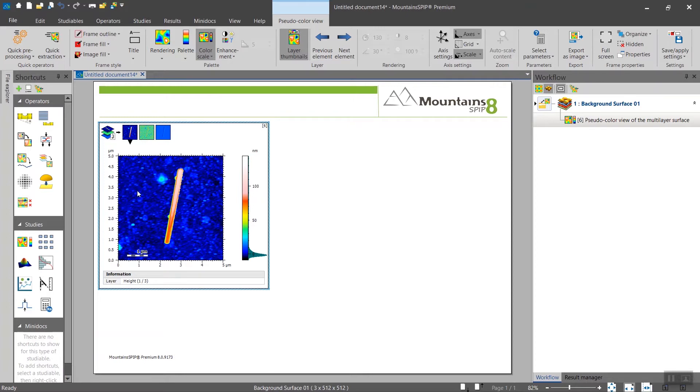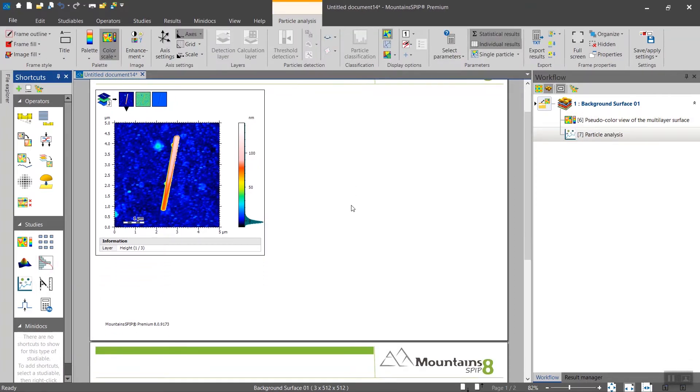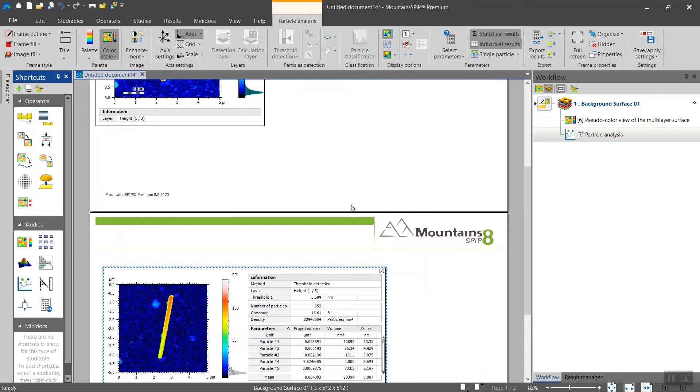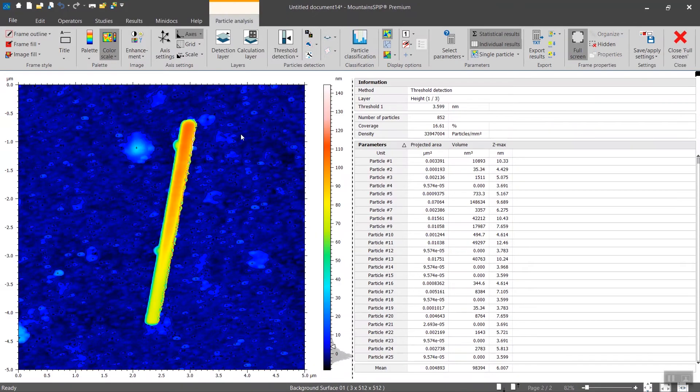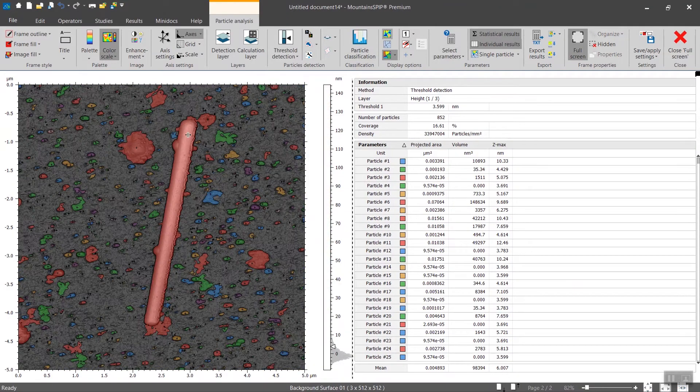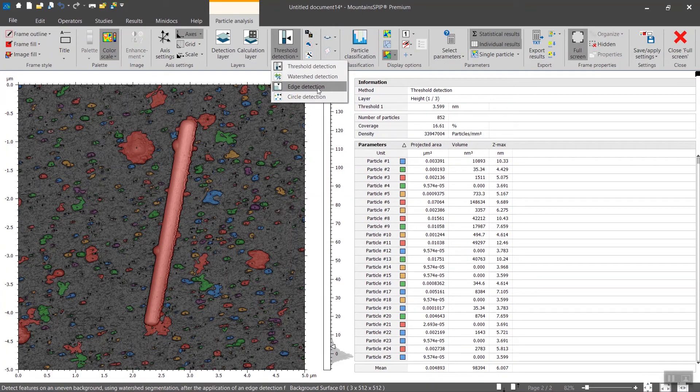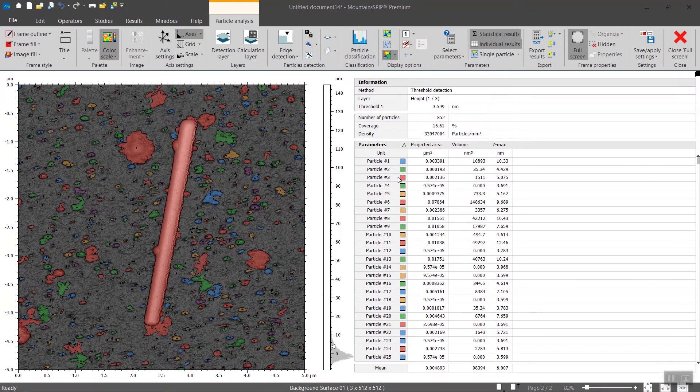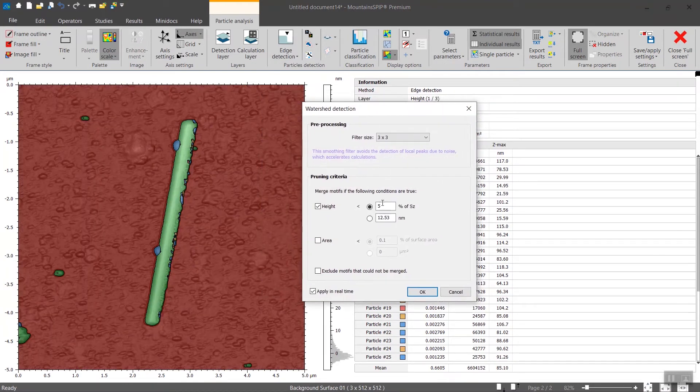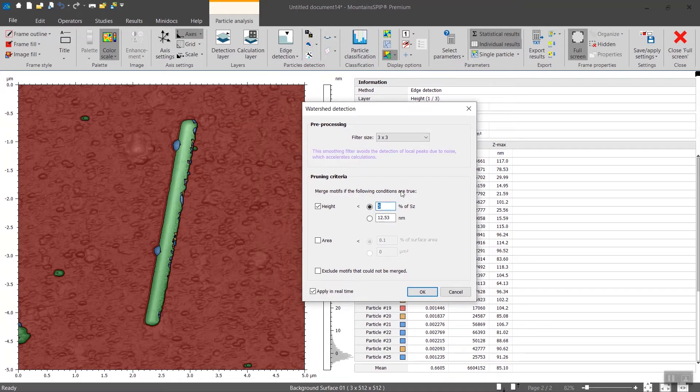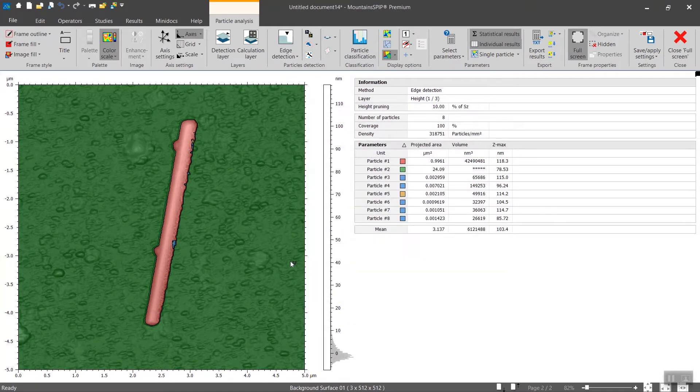So here's how. We will first detect the tube and we can use the edge detection. Okay, like that. We will increase this criteria 10 percent. Okay, then you click on okay.